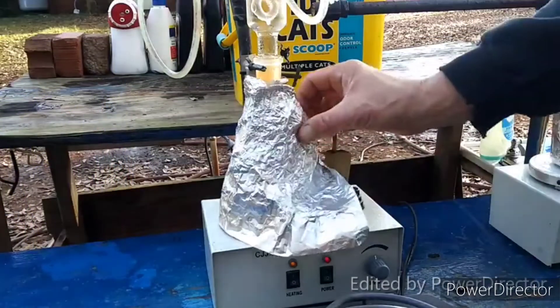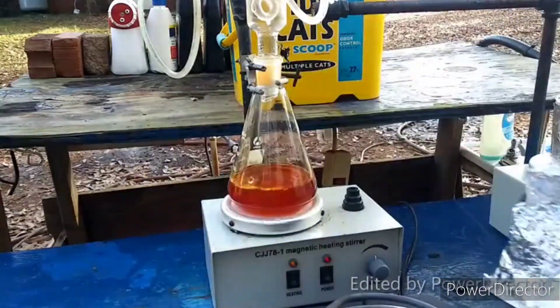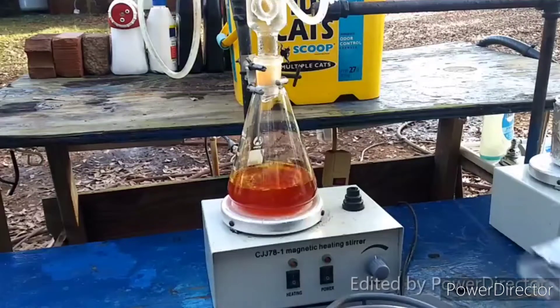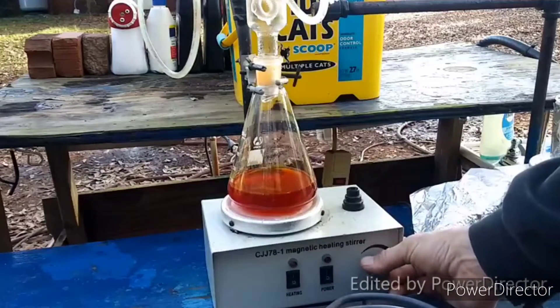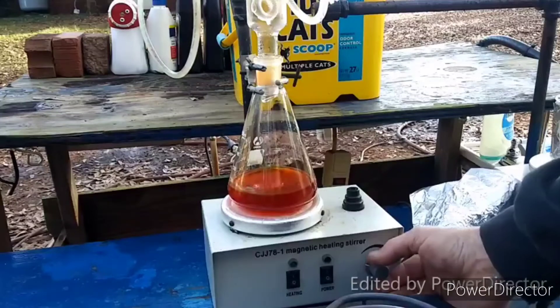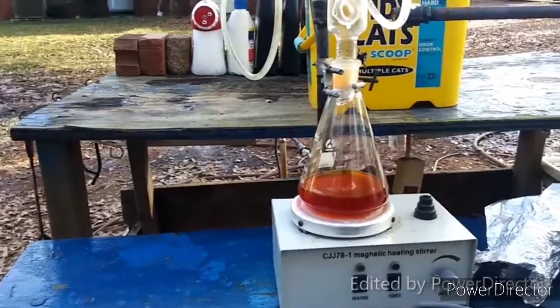That did not take long at all. I don't know that I would even bother with putting a reflux column on it, to be honest — just wrapping it up in foil and heating it up. It said it needed to gently reflux until everything was dissolved, and everything is dissolved. That didn't take very long at all — maybe 10, 15 minutes. I was really expecting it to take a lot longer based on how the textbook was reading.